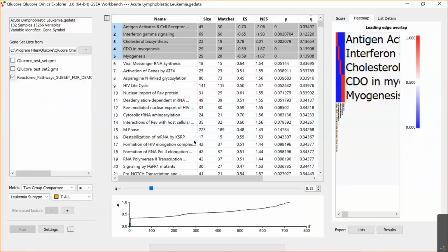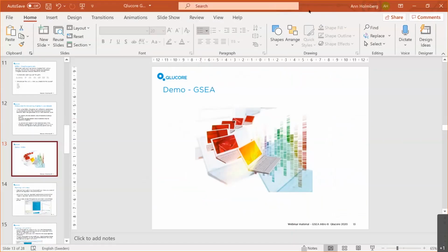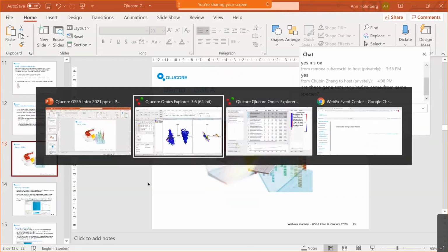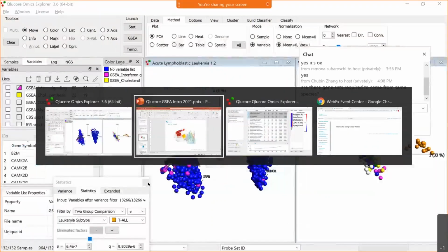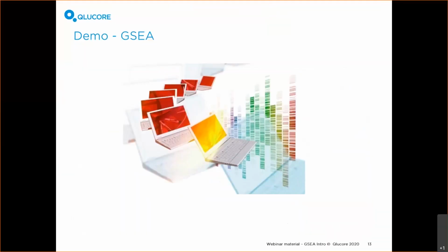So that was the end of the demo, and now I will talk a little bit more. Any questions on the actual demo? No? Then we continue. So let's just maximize this again, like that.